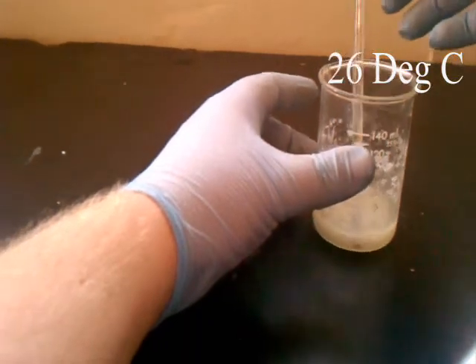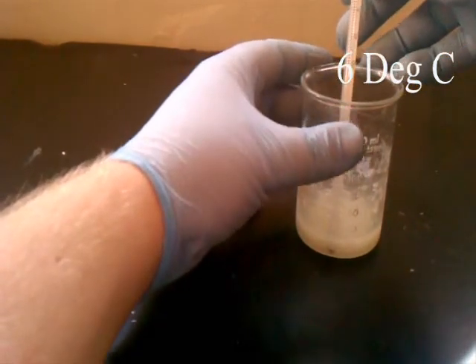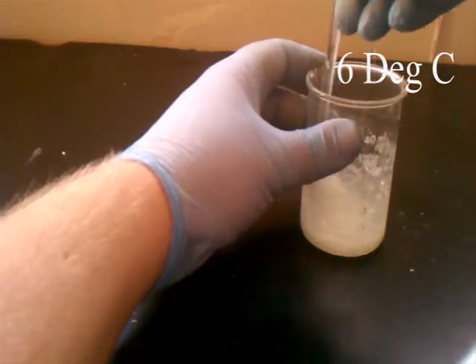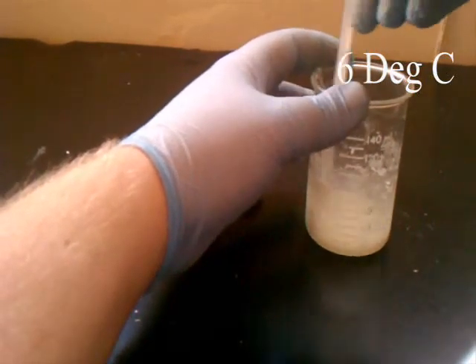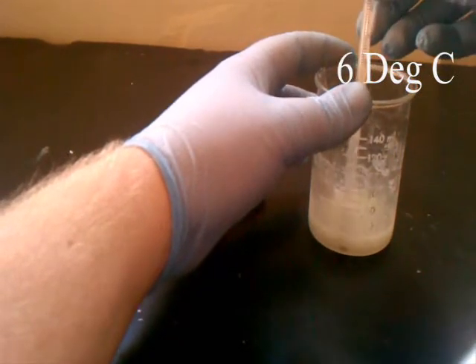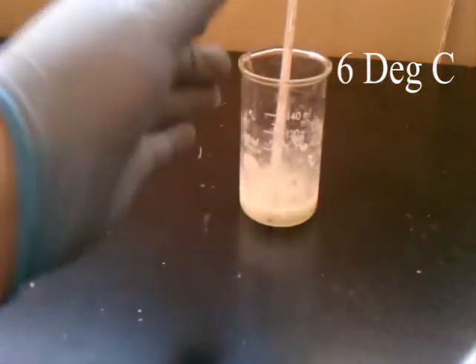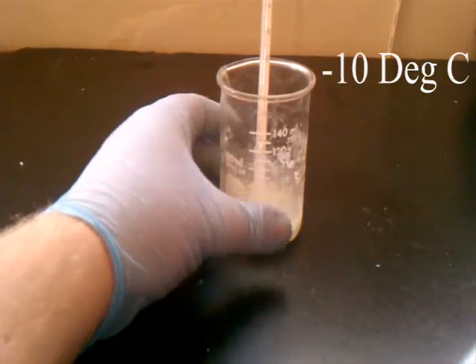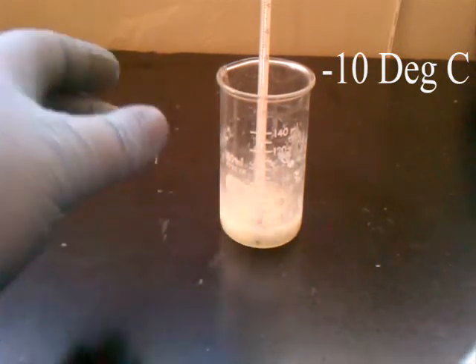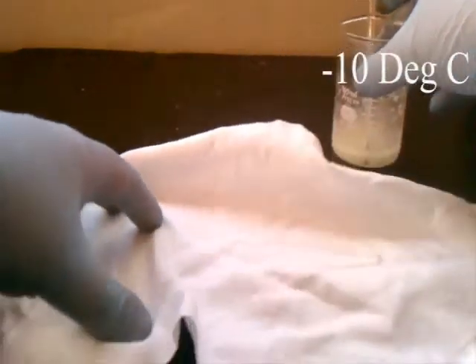If you take a look at the temperature, we can already see we are down to six degrees, and the reaction has just begun. We continue to stir and agitate the solution to make sure everything comes in contact. As the mixture turns into water, the products dissolve into the water, and the action of dissolving increases the rate at which it reacts. It is now down to negative ten degrees C, and that is much colder — our previous temperature from the ammonium nitrate was only ten degrees C, so we have dropped a considerable amount more.